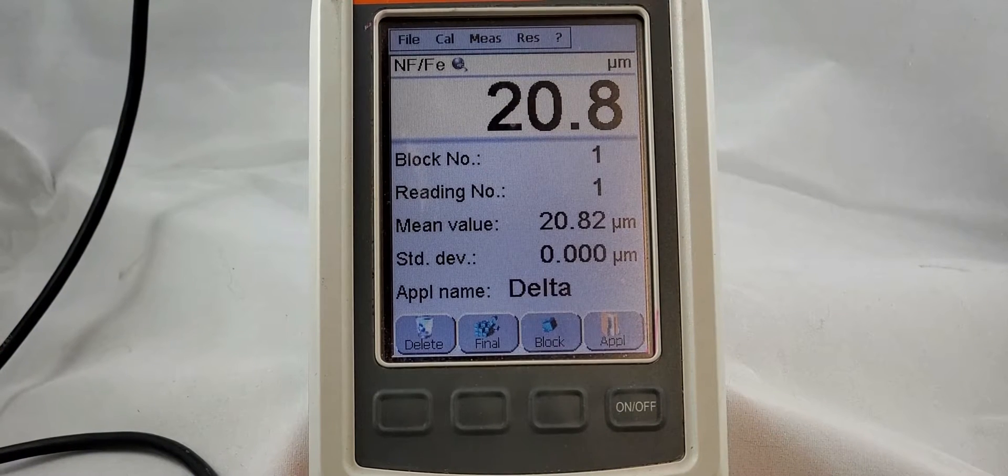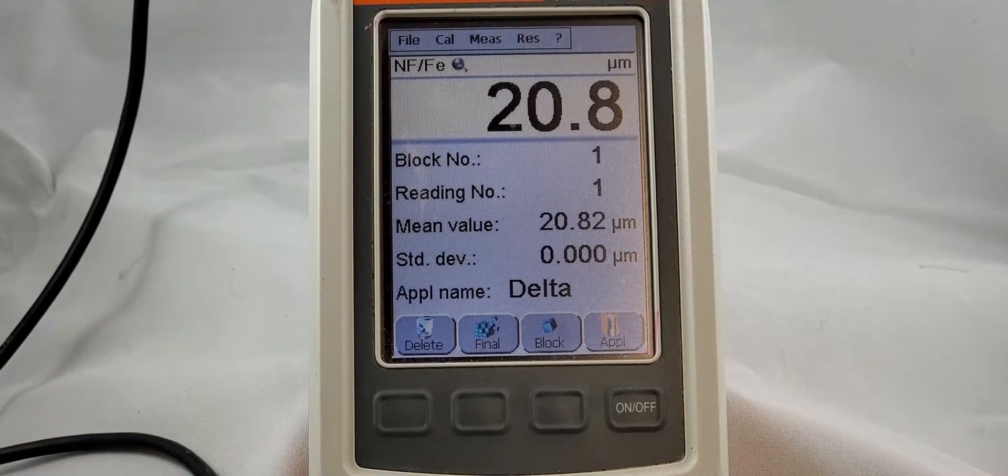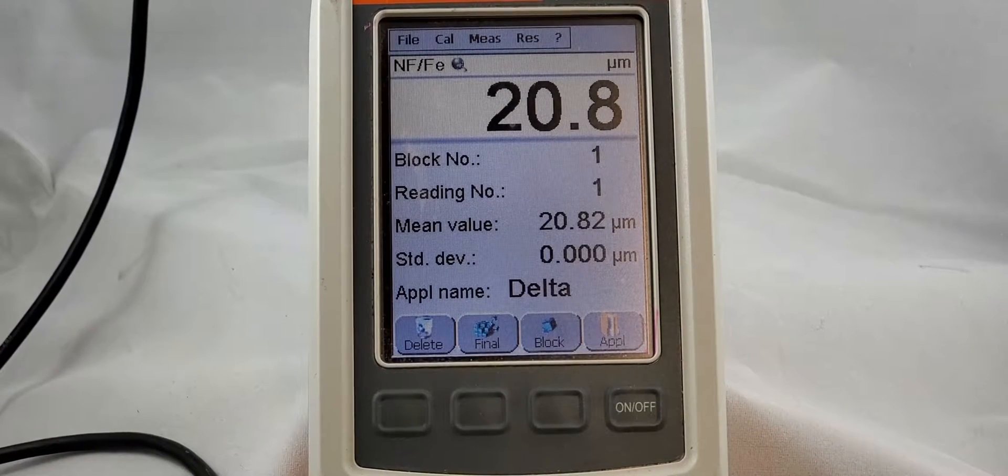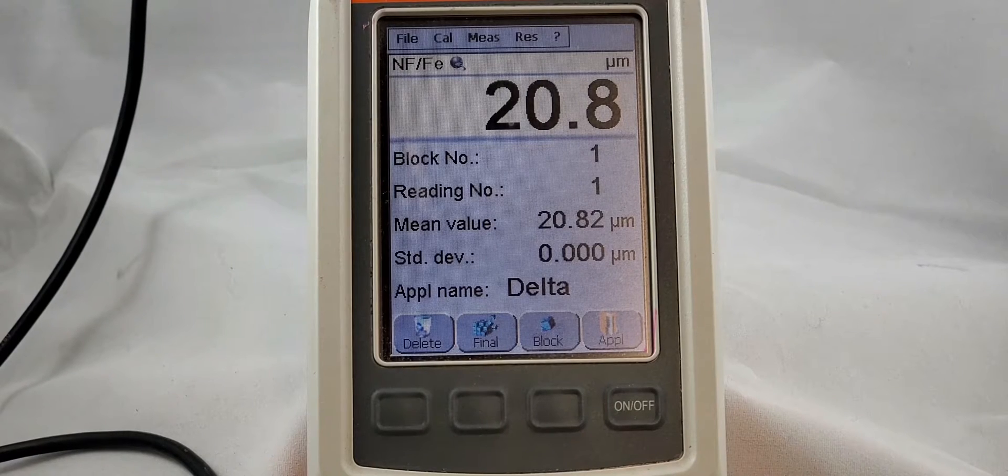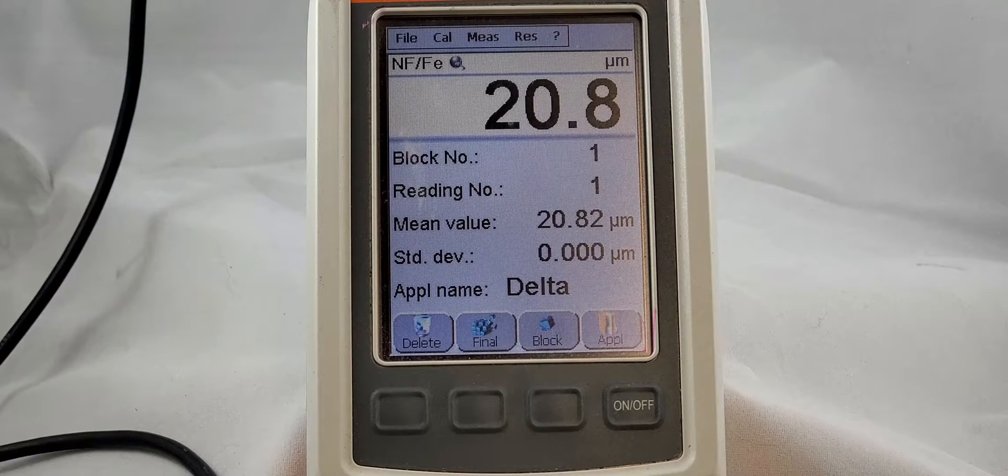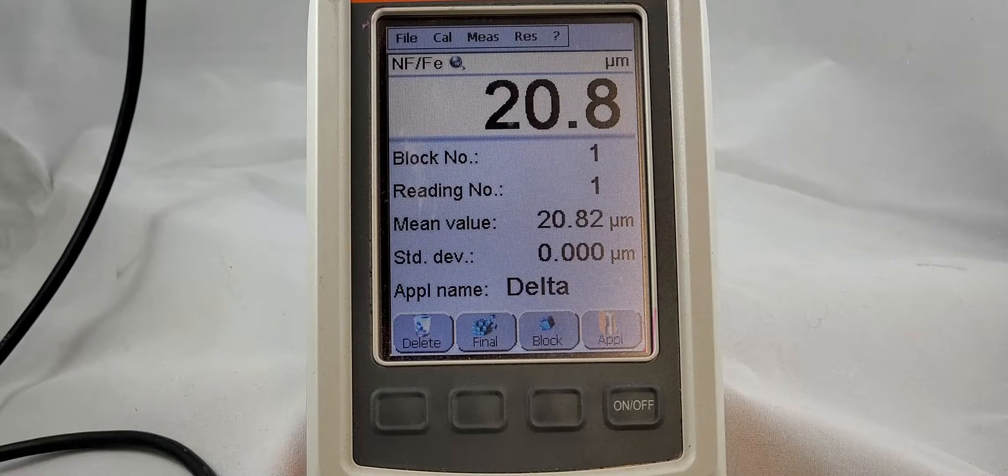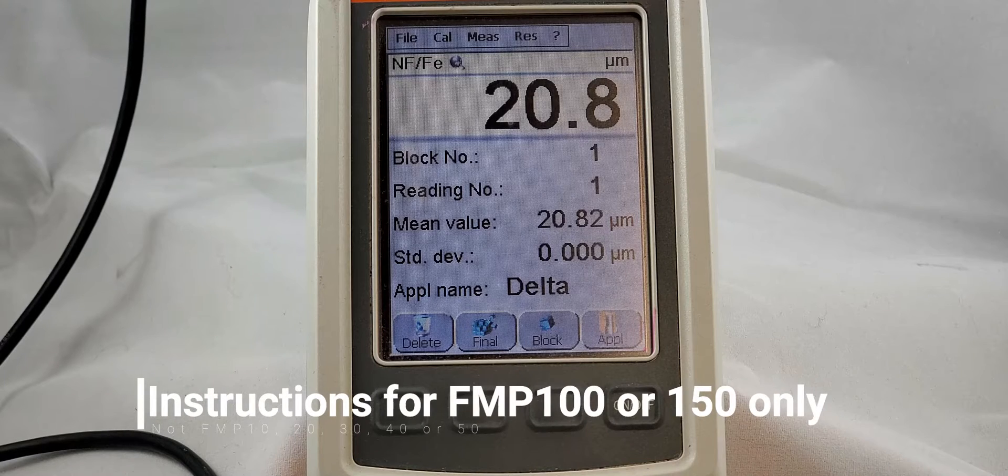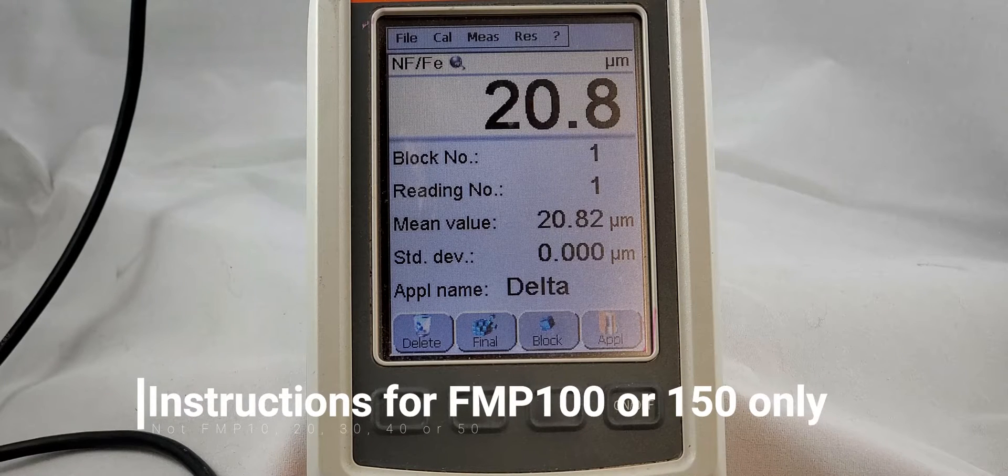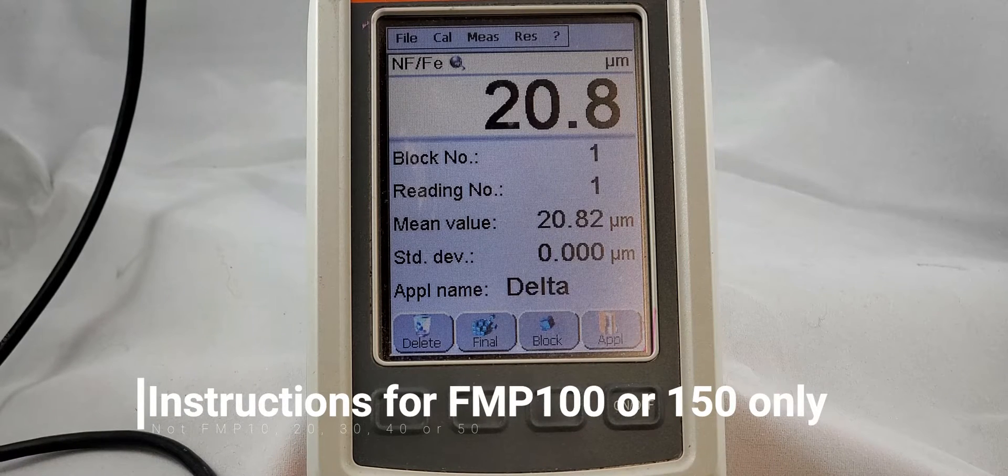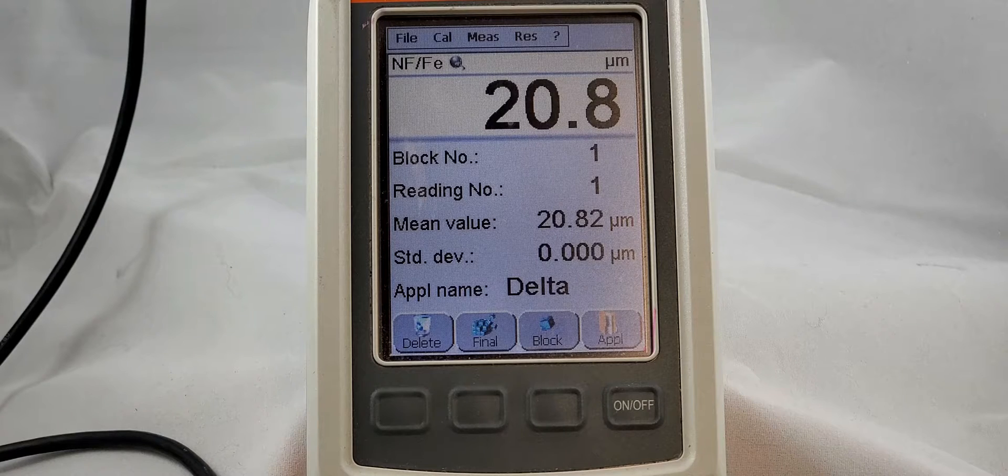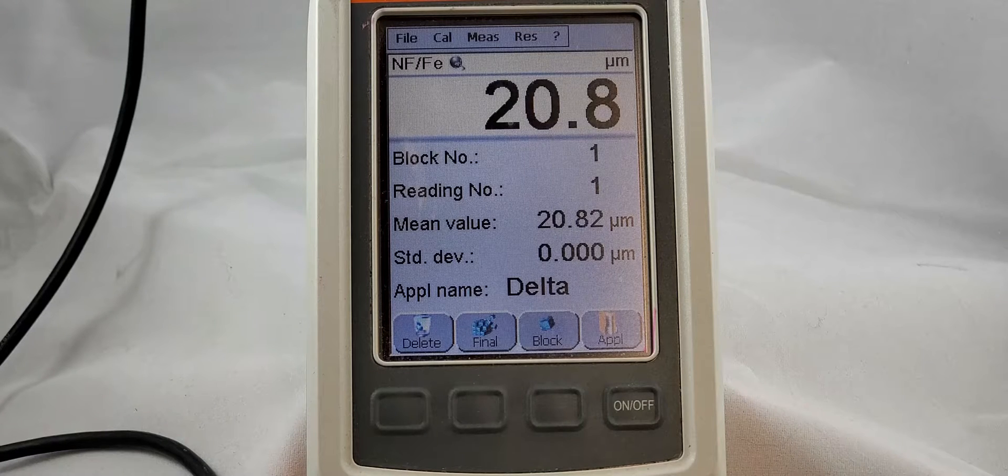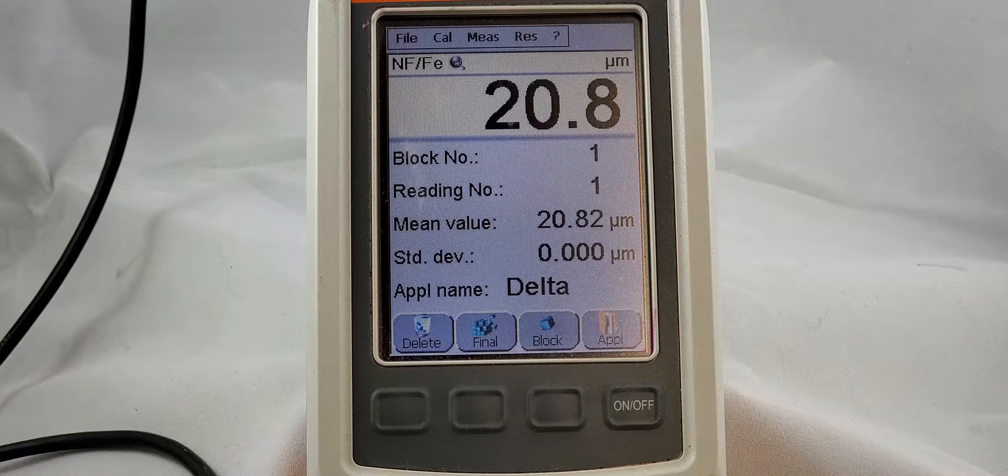Less from Delta and today we are going to calibrate an FMP 100 and 150. Now just like I said in the how to calibrate an FMP series handheld, it's a special set of steps that you need to go through for the 100 and the 150.